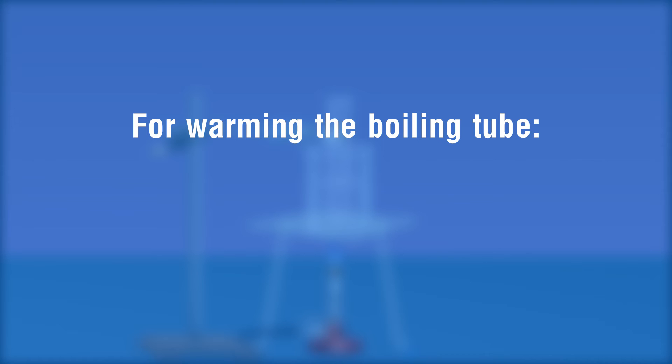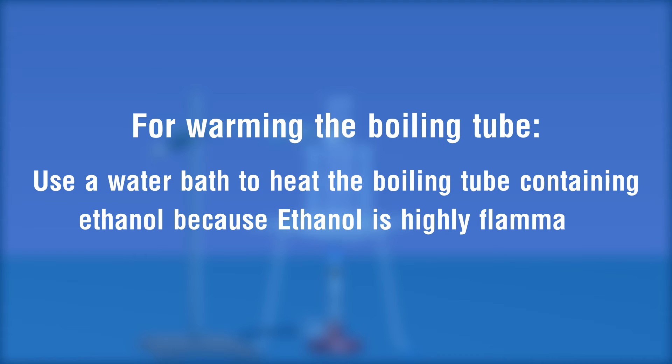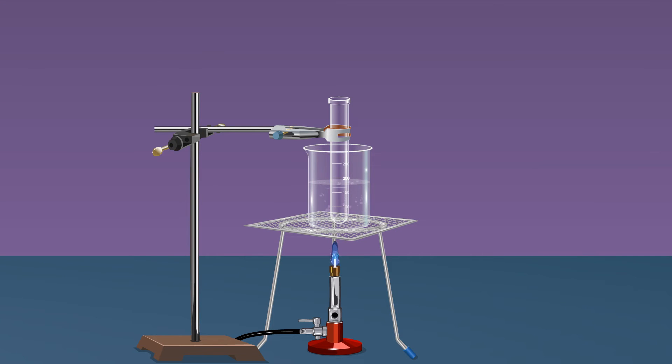For warming the boiling tube, use a water bath to heat the boiling tube containing ethanol because ethanol is highly flammable. The boiling tube containing liquid is uniformly heated or warmed in the water bath at 60 degrees celsius.